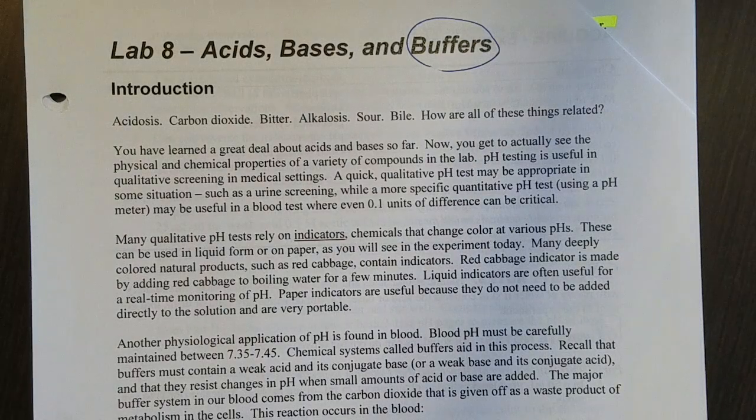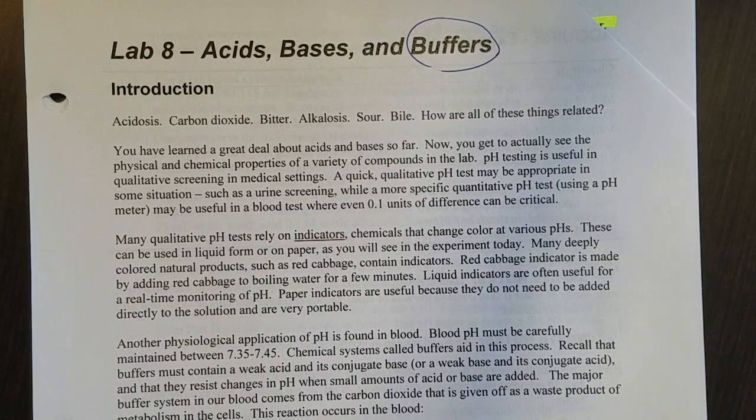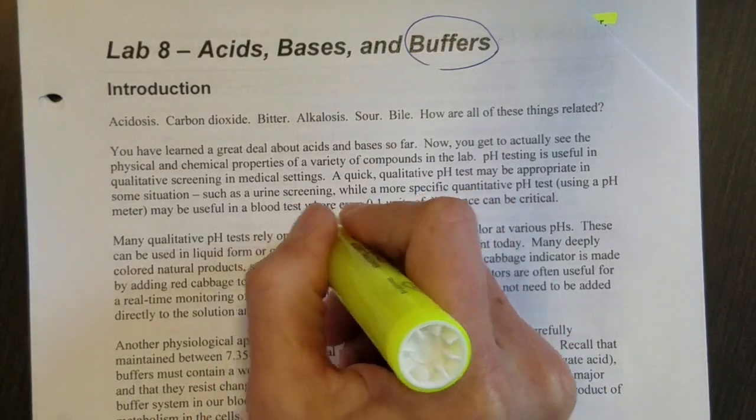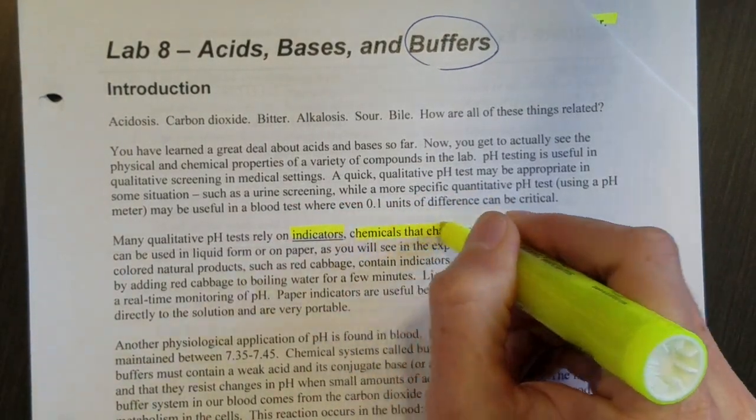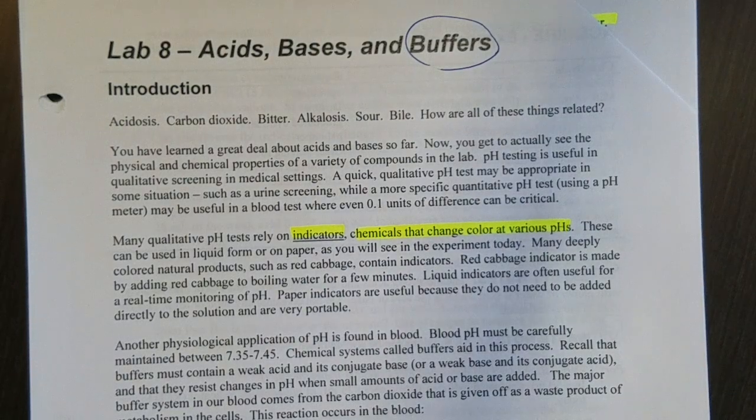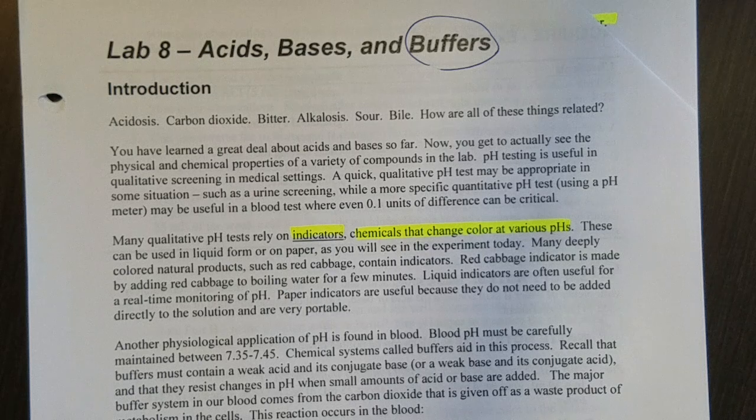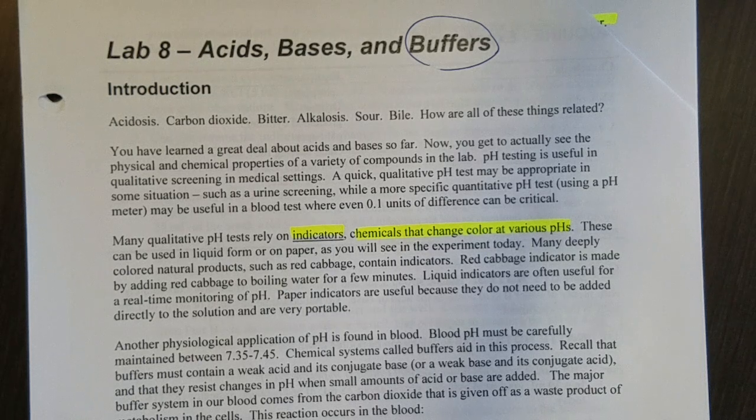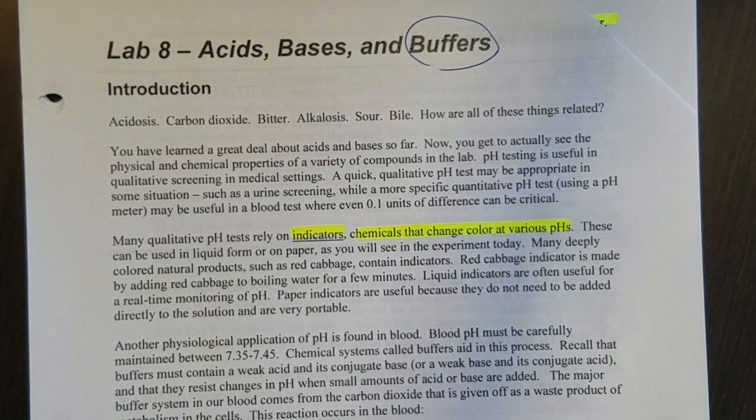but I hope it'll help you understand especially buffers. So a couple of things in the background here that I want to draw your attention to. We will be using in this experiment indicators and those are chemicals that change colors at various pHs. We'll be using red cabbage indicator, which you get by just boiling cabbage, and then there's also a variety of indicators in the pH paper. That's just a little bit less messy than having a liquid indicator.